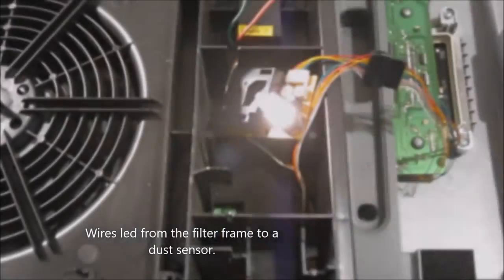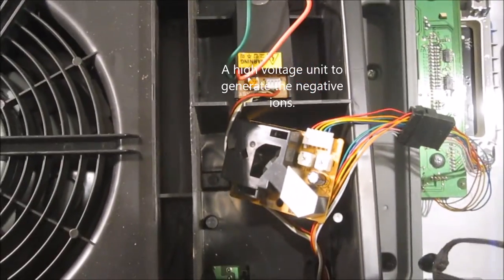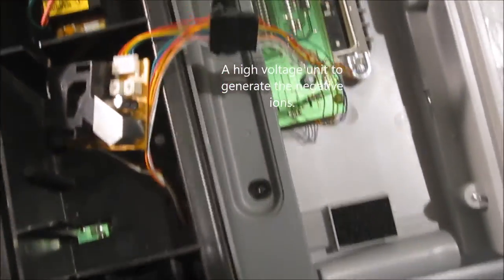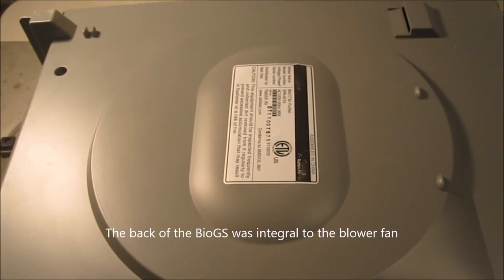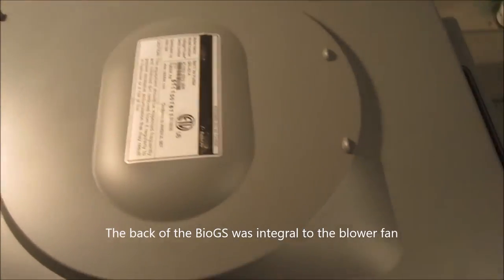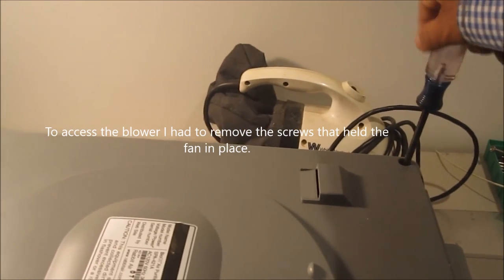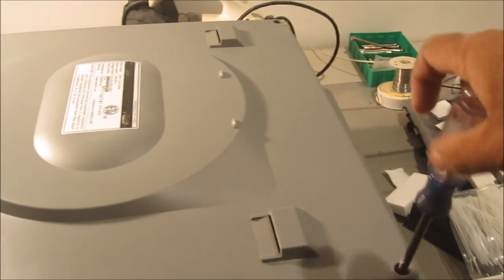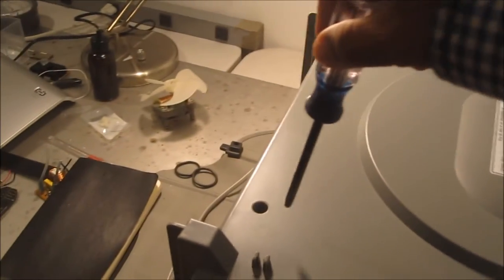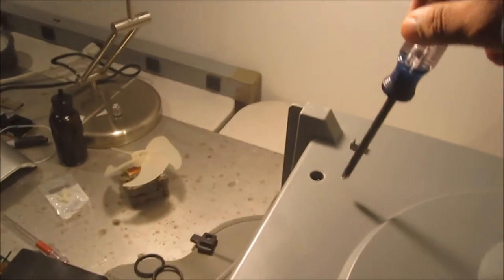Once I had the frame off, I could see the electronics. On the bottom right is a dust sensor. Just above that is a high-voltage ion generator — quite neat. The main board is on the right. The bottom of this air purifier is also integral to the blowers — I thought I could get away without it, but it was required, so I removed it and will be attaching it to the MDF sheet to form the base of the fan.